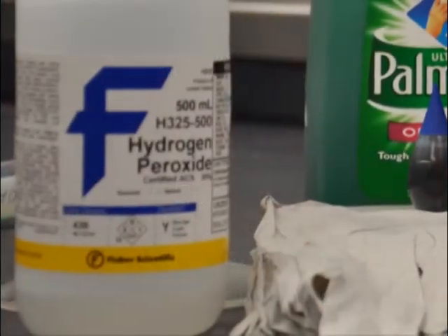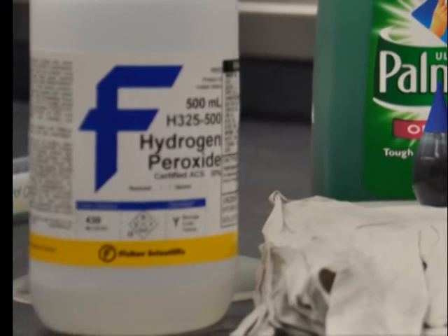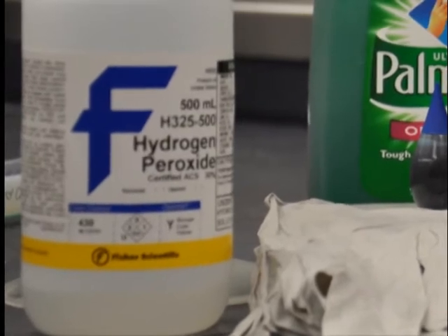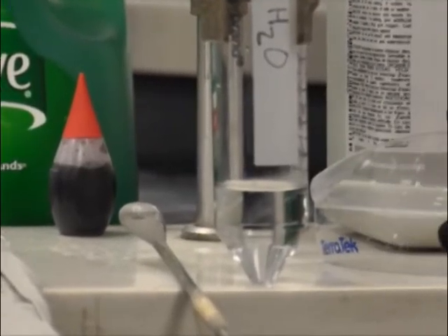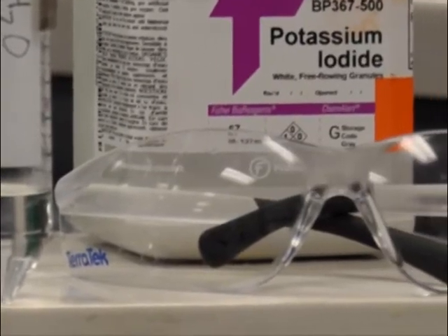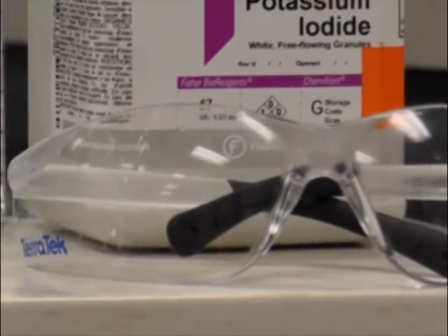In this experiment, we will be making elephant toothpaste. To follow along at home, you will need aqueous 30% hydrogen peroxide, liquid dish soap, liquid water, and solid potassium iodide. To protect your hands and eyes, you should also wear goggles and gloves.